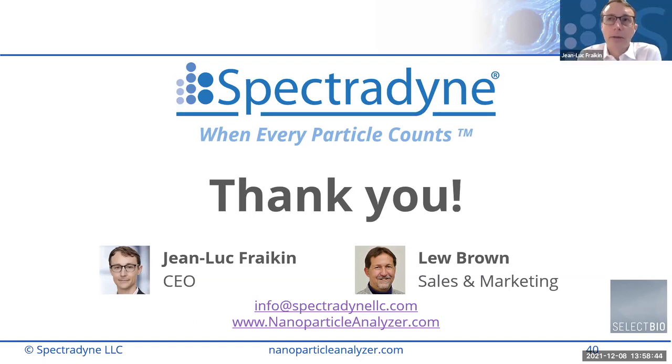Great questions. So to the first question, I think it's clear from the discussion of how the DLS works that there are many different size distributions that can yield the same Z average, right? It's really just telling you some kind of weighted average of all the particles that are scattering detectable light. So it's not surprising that there can be significant differences in the distributions that are indistinguishable by dynamic light scattering.